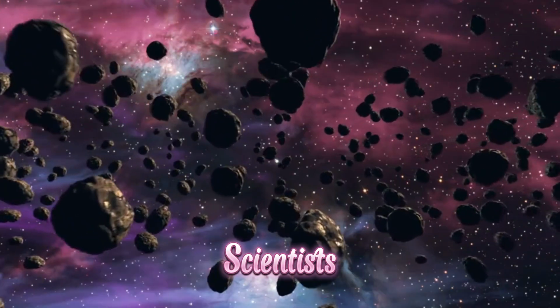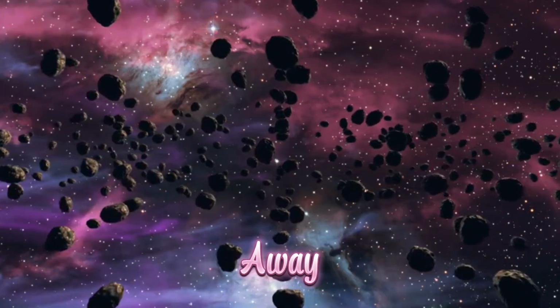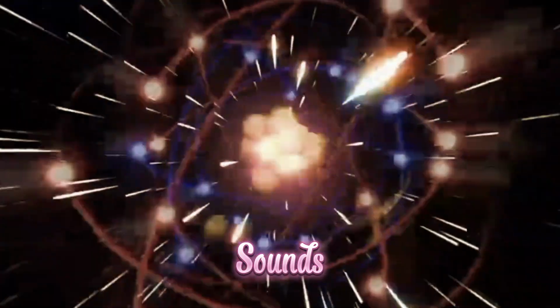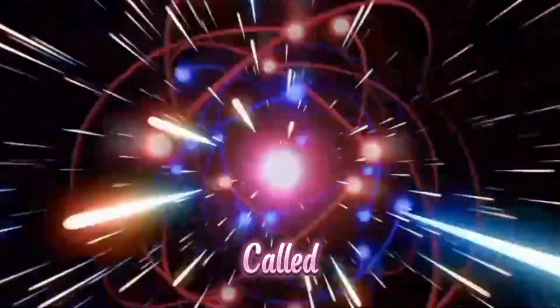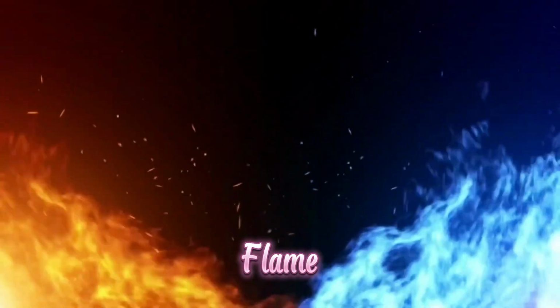Ever wondered how scientists know exactly what elements are in a star millions of light years away, or how they check for tiny amounts of lead in your drinking water? It sounds like magic, but it's pure science, and one of the coolest techniques they use is called Flame Atomic Spectroscopy. So, what on earth is Flame Atomic Spectroscopy, or FAS for short?